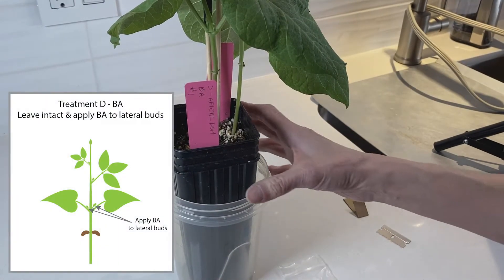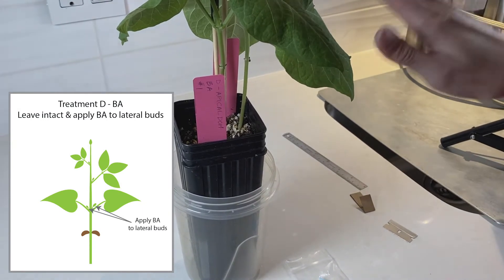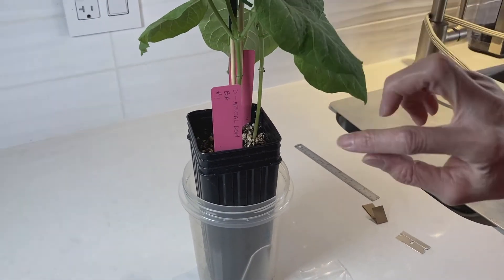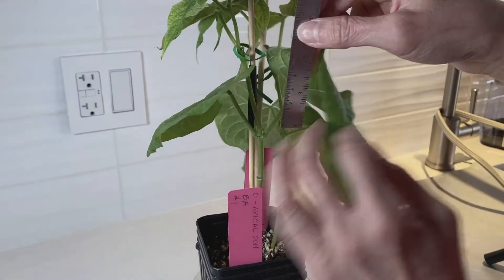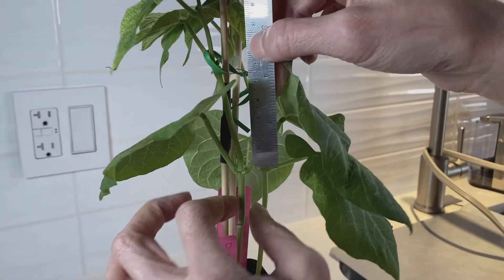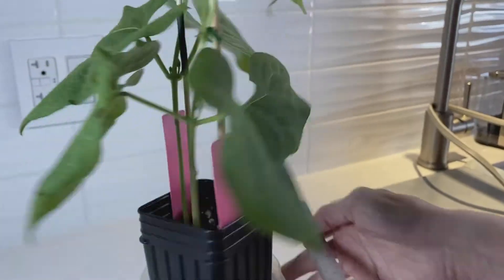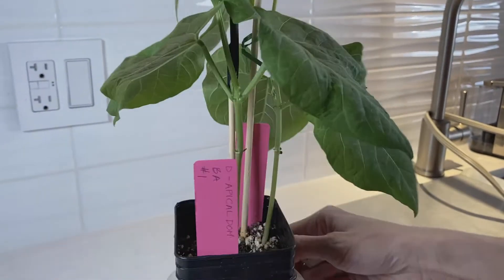Here we have the pot for treatment D. For treatment D, we're not going to cut the plant at all — the plant stays intact and we're just going to apply BA to the lateral buds at the primary node. Before you apply the BA, make sure you measure your lateral buds for both plants and record it for plant one, then do the other side and measure and record for plant two.